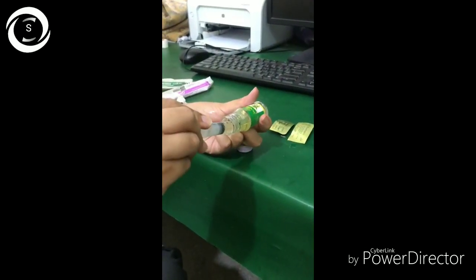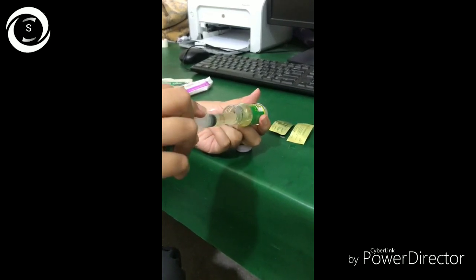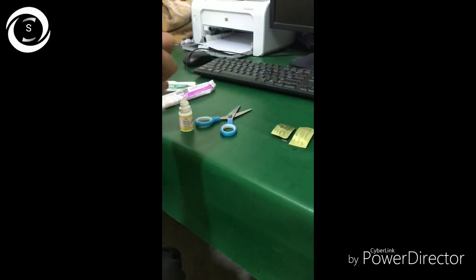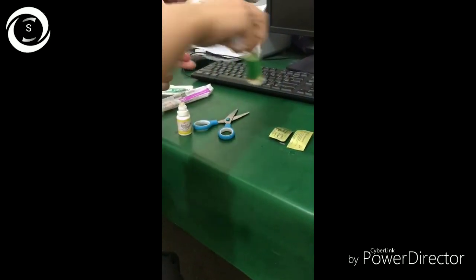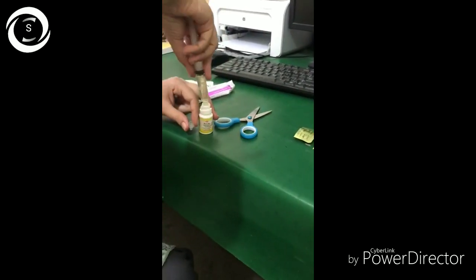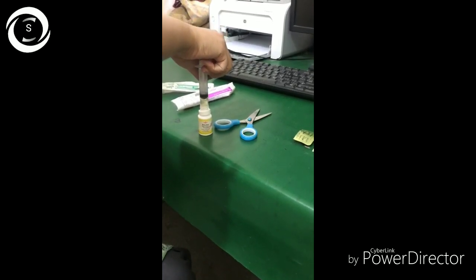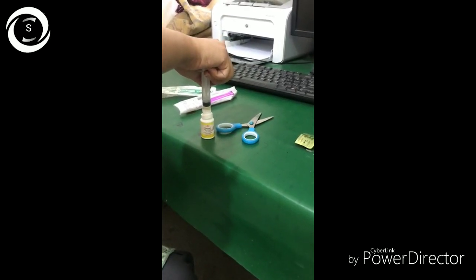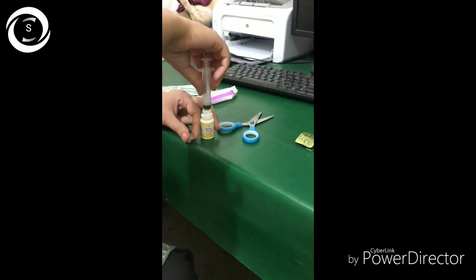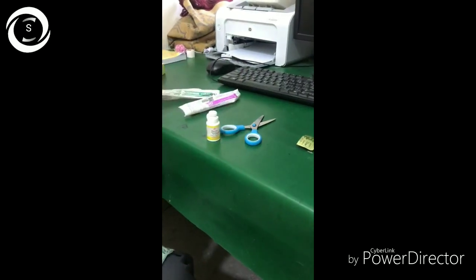Then you put the 25 milligram Sandimmun Neoral tablet — it is in a gel form — so you squeeze it out either into the syringe or you can squeeze the capsule directly into the bottle, and that will make 0.5% cyclosporine drops.